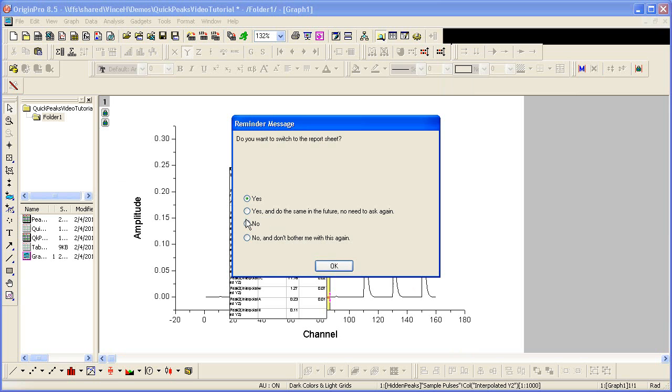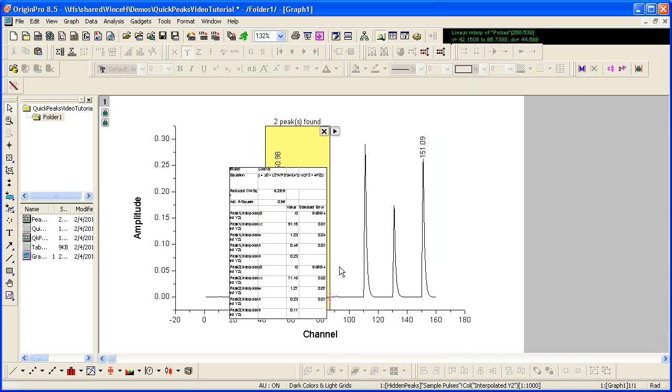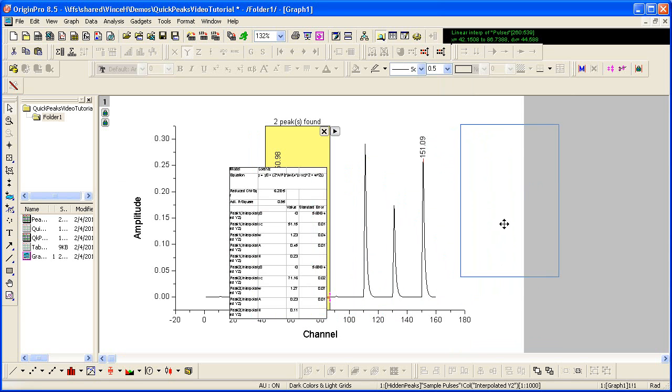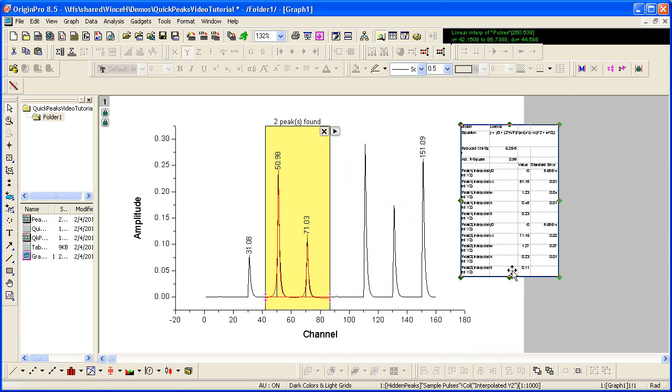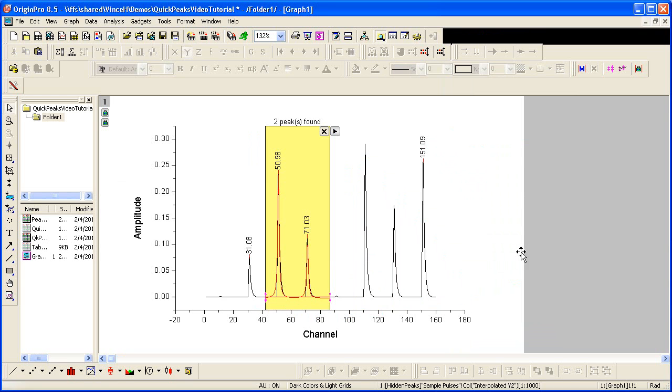Fitting takes place automatically and a small report table is output to the graph. You can choose to keep that report table or delete it. Notice that the fit line, the best fit line, is put on the graph by default.